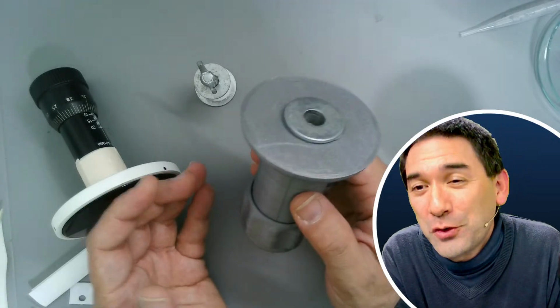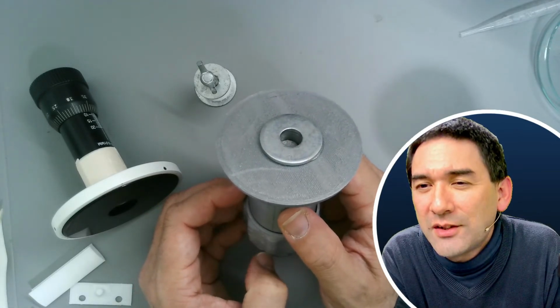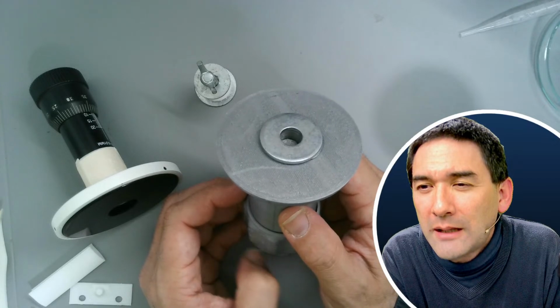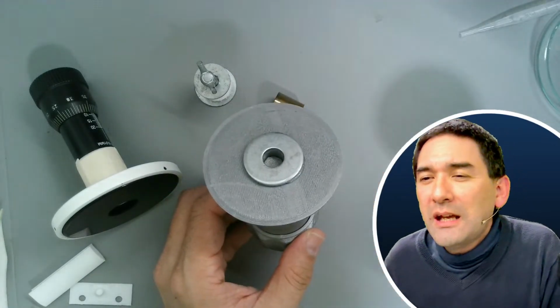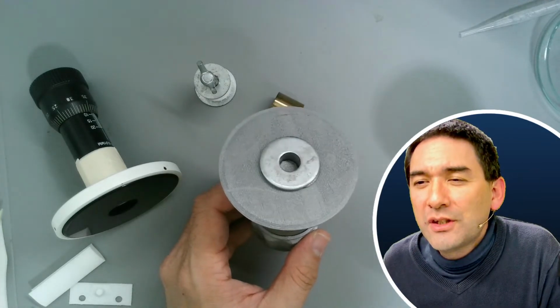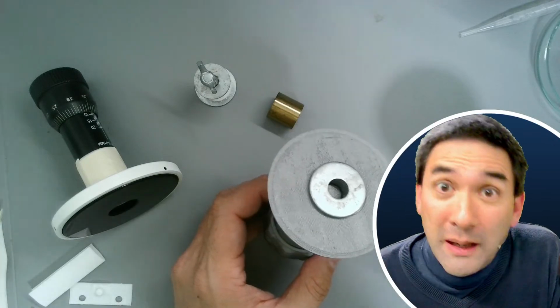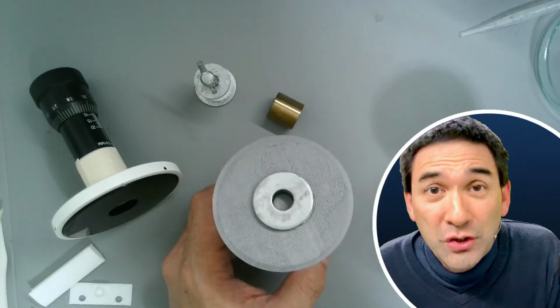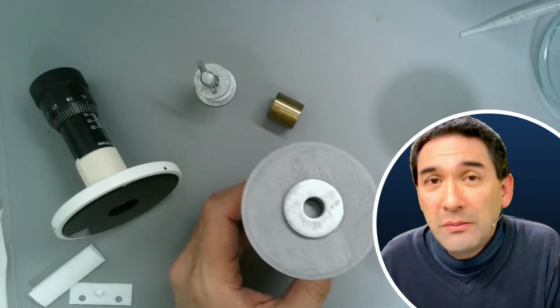Okay, so there's already a first question here. Why did most of my expensive professionally prepared zoology slides, which I bought from a reputable laboratory, not come with abbreviations of the type of sections that the specimens are? So, for example, WM like whole mount, or CS for cross section, or LS for longitudinal section. I think this is what you mean.